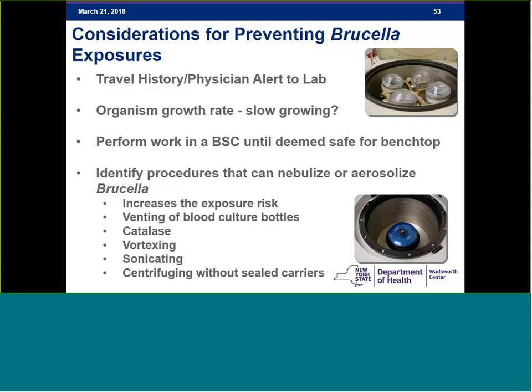Every laboratory should conduct a risk assessment and determine which laboratory procedures can cause aerosolization, directly increasing exposure risk. Some of these procedures include venting of blood culture bottles, which should always be vented in a biosafety cabinet, vortexing, and sonicating. MALDI should be a last resort and avoided when potential high-risk pathogens are suspected. It is also important to remind medical staff to alert the laboratorians when a patient has symptomology characteristics of brucellosis or has travel history in areas where Brucella is endemic.